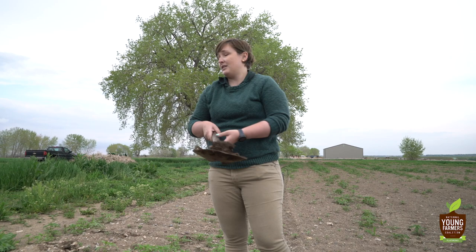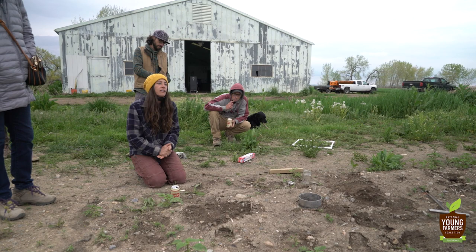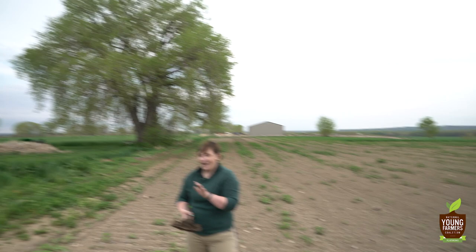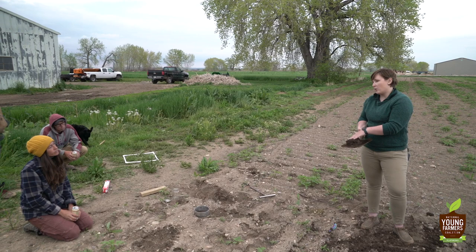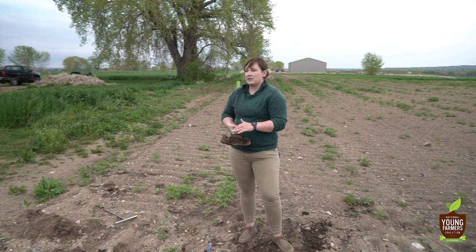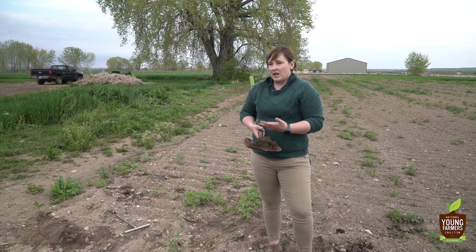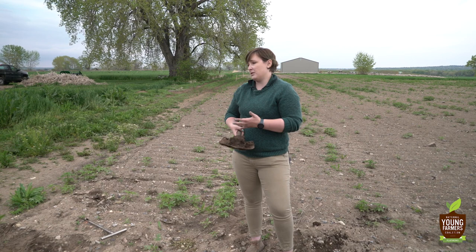So I'm super curious, I'm just wondering if air drying is the same for PLFA and TDN? I would double check. Every lab will have a slightly different protocol. Every lab will want you to fill out their form a little bit differently. So this is pretty much the 100% standard way to take it for any generic soil fertility test, regardless of the lab you go to. For PLFA, TDN, not so much, Haney. They might have specific collection methods listed, typically on their website, because they'll want the samples to be preserved in a specific way. Sometimes, depending on what soil test we're doing, we either need it dry, or we need to keep it cold, and so on and so forth. So just double check. If you have questions, you can contact the labs.